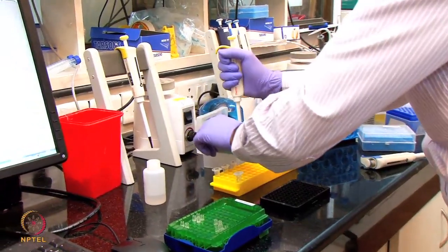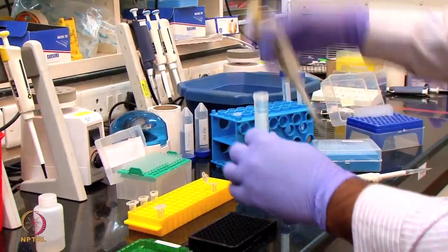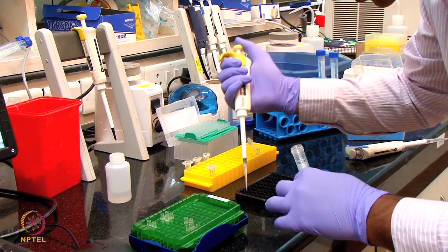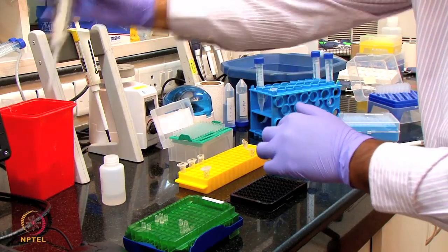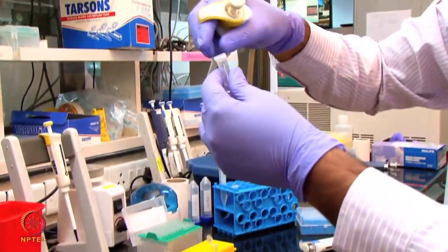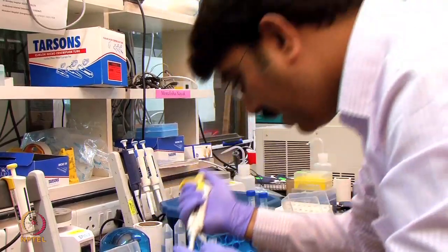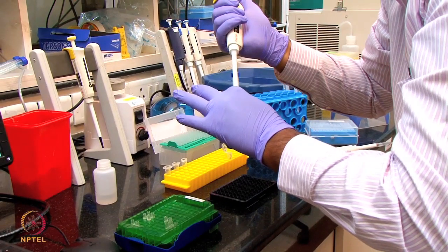I'm taking 200 microliters of the 1x PBS buffer. This is prepared. I'm going to add 200 microliters to each well of the 96 well plate. Now I am putting in the biotinylated anti-apolipoprotein. I am going to add 200 microliters of the biotinylated anti-apolipoprotein to the 96 well plate.